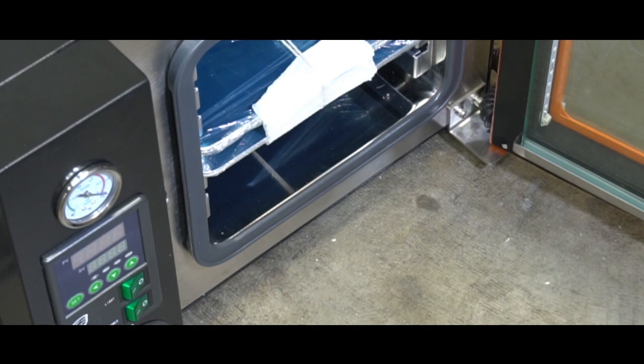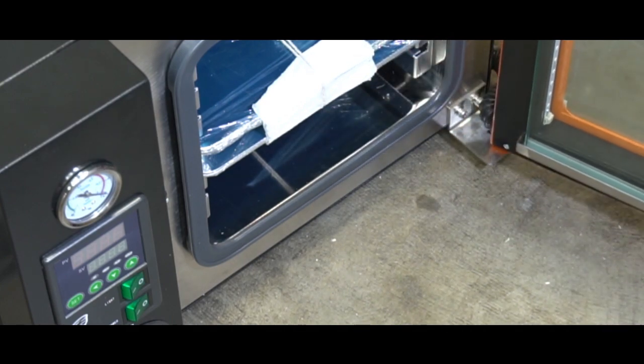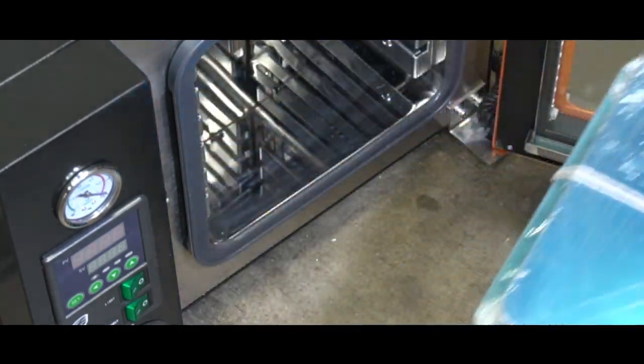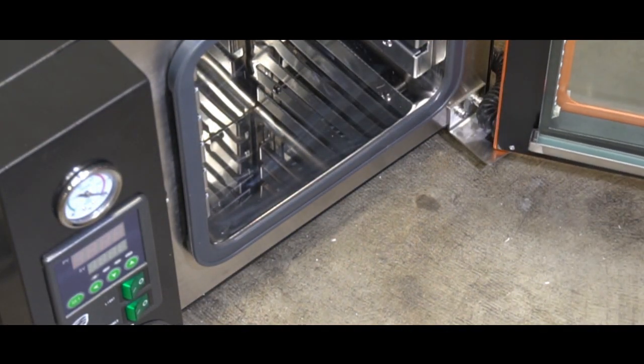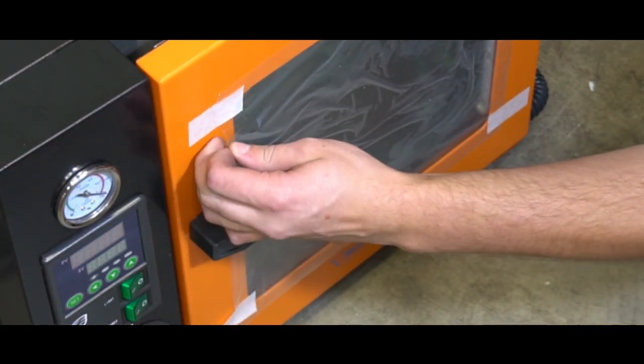This is our .9 Eco — it comes standard with four shelves. The 1.9 model comes with five shelves standard. Go ahead and remove your shelves altogether; they're saran wrapped and tied together for shipping safety.